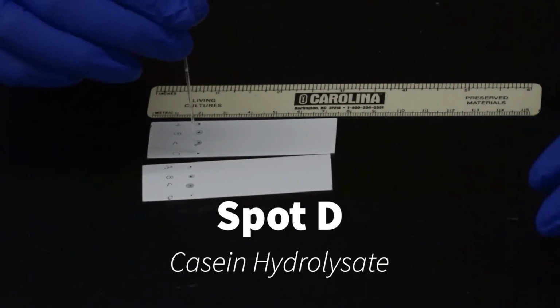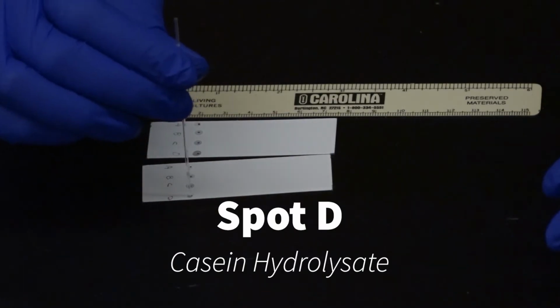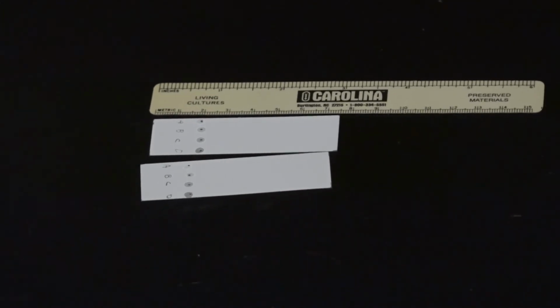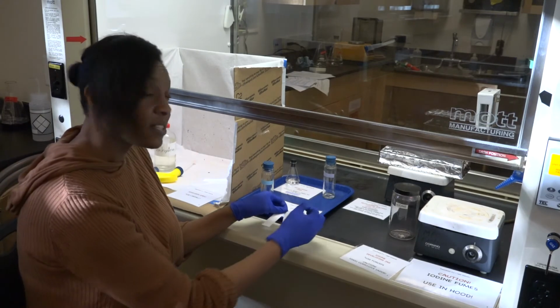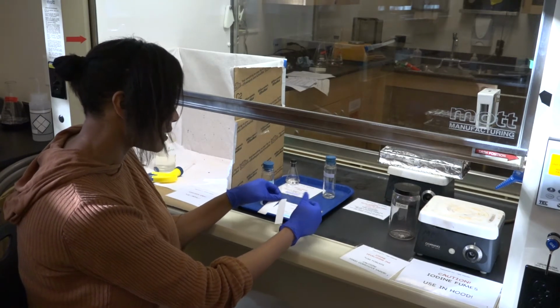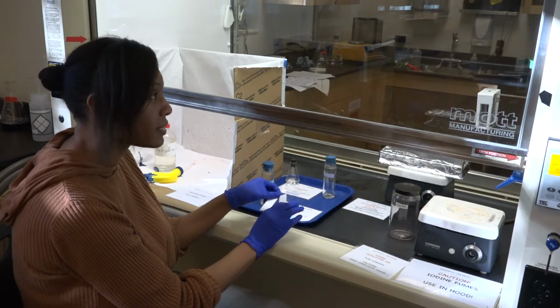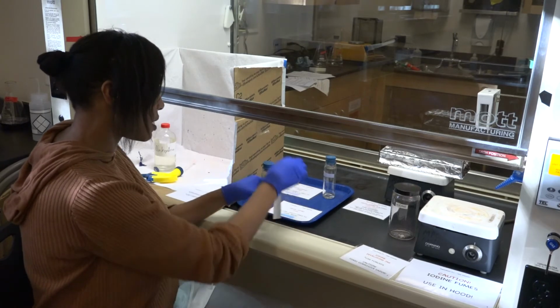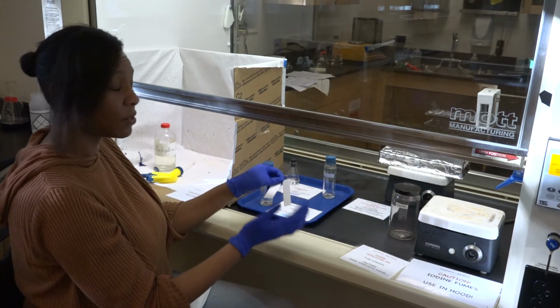Capillaries are the best. And now we're ready for the solvent. All right, so you'll see that we're at the hood, and that's because we are working with some chemicals that you don't want to inhale into your lungs. This has a negative pressure. So I have my developing jar here. I'm going to drop our chromatography strips into it, and then we're going to let them do their thing.